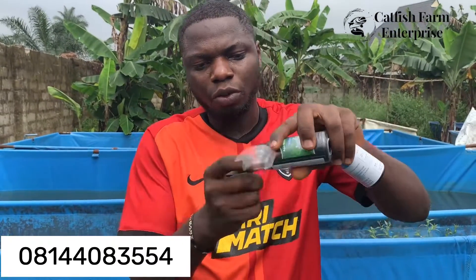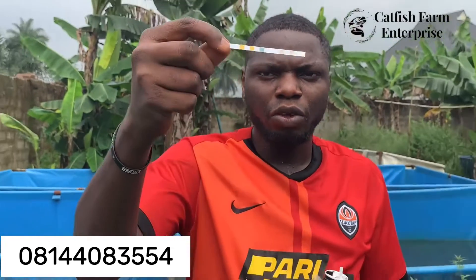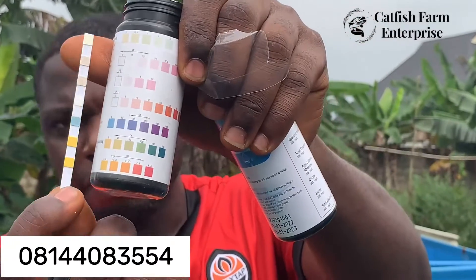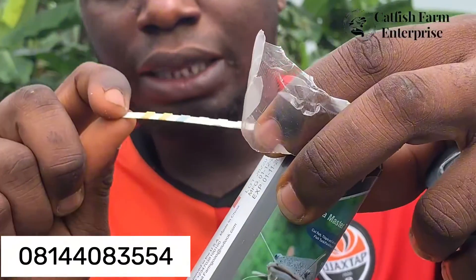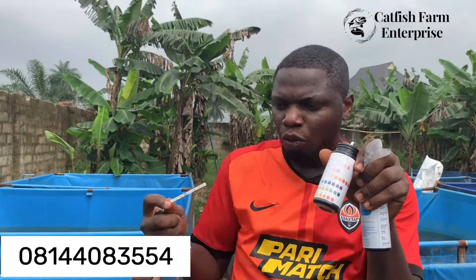Once you open the test kit you can see it has 100 strips in it. This is how it looks — it has the 7-in-1 parameters. You dip it in your pond, or you can fetch water out of the pond and dip the strip in it. Leave it for just two seconds, then bring it out and compare the reading with the chart. The chart shows values from zero to six for each parameter, indicating which values are okay and which are bad.